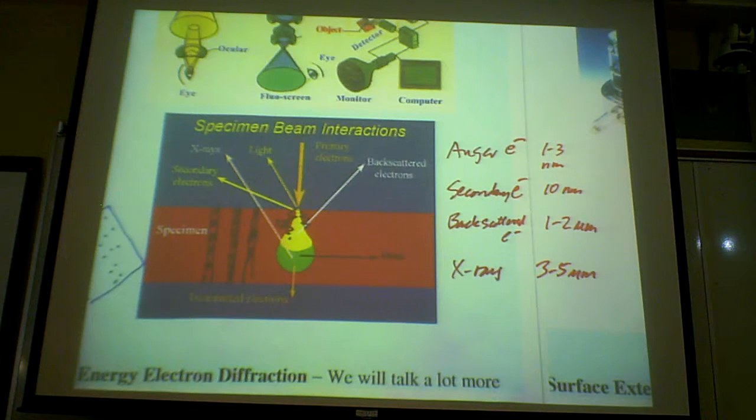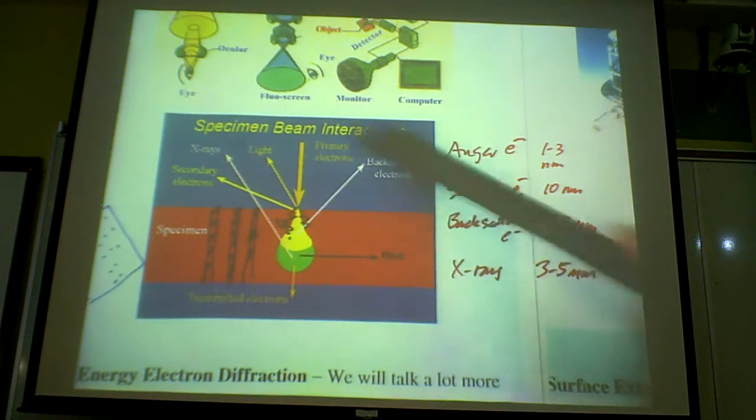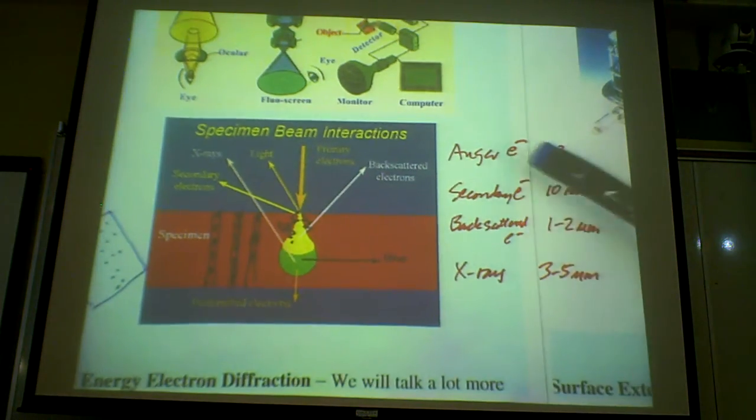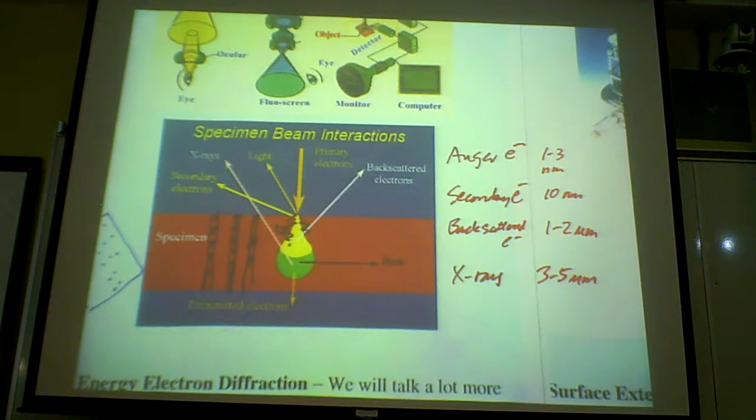Okay, so this sort of gives you, I like this plot a lot because it contains all the qualitative physics of what would happen as the electron beam hits the material.